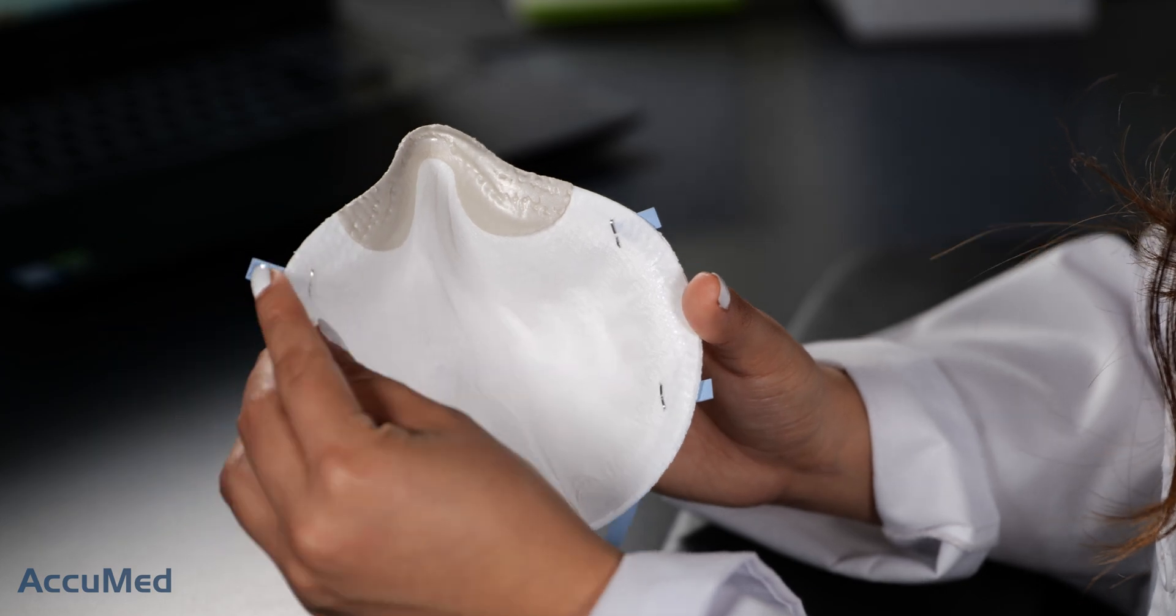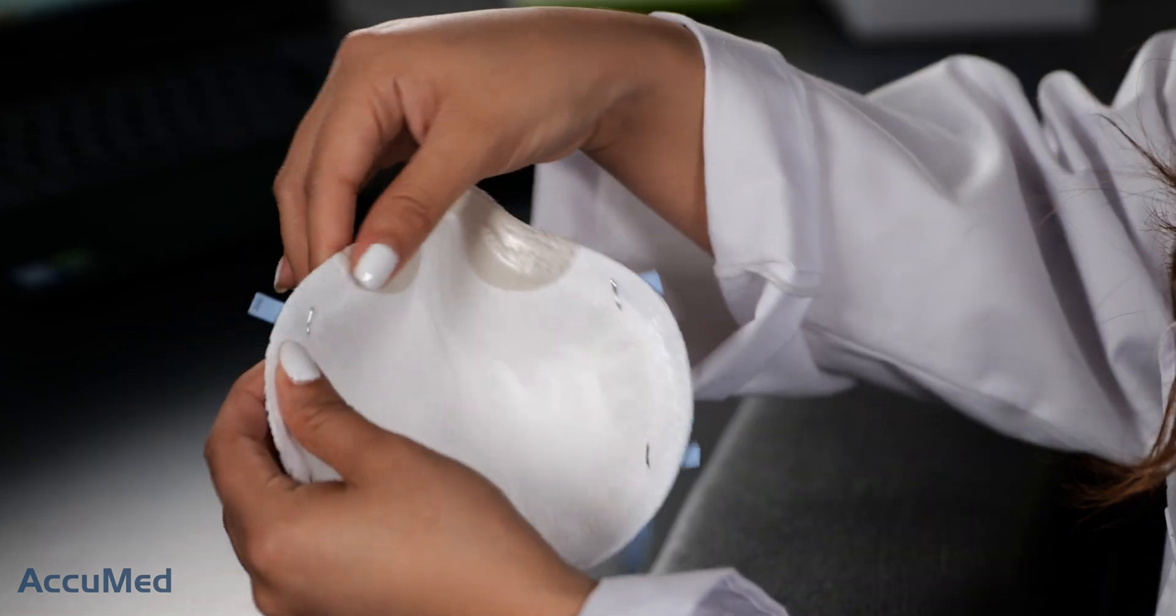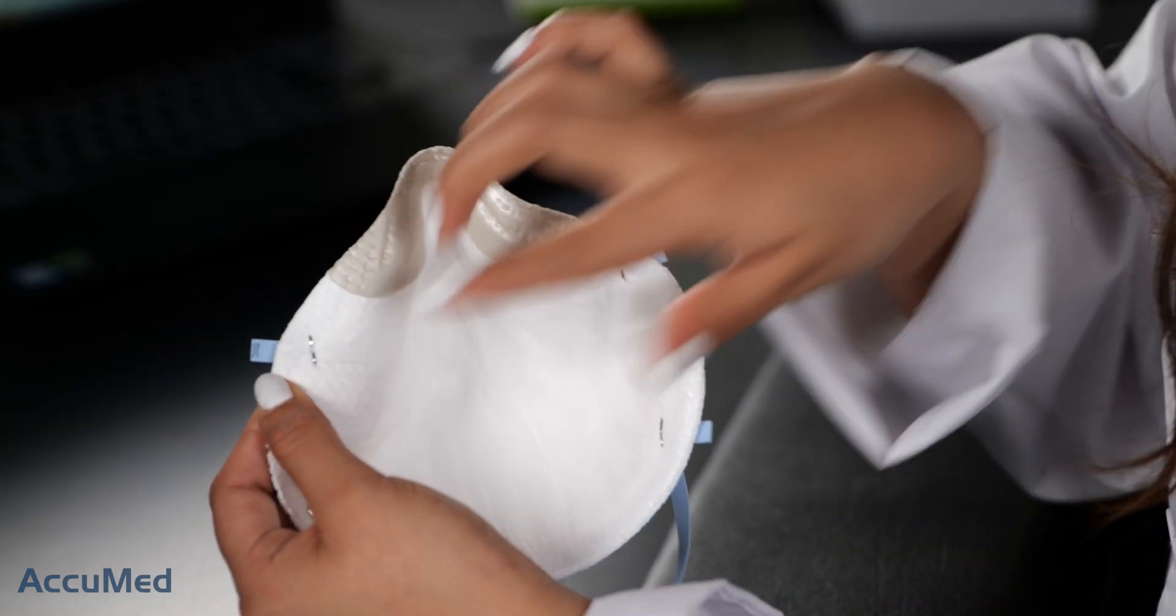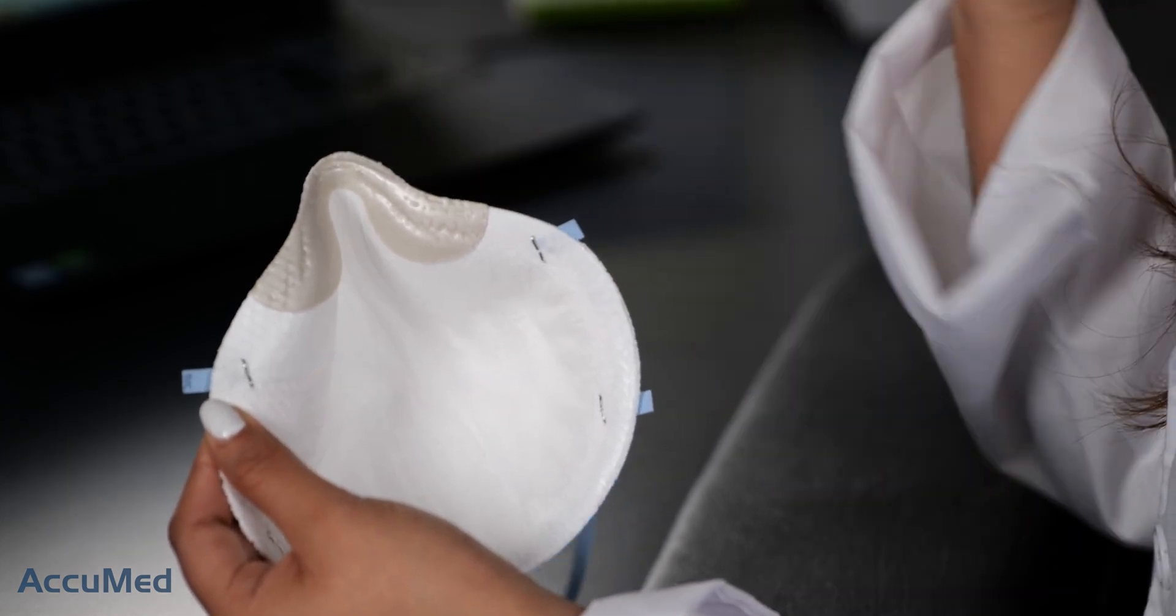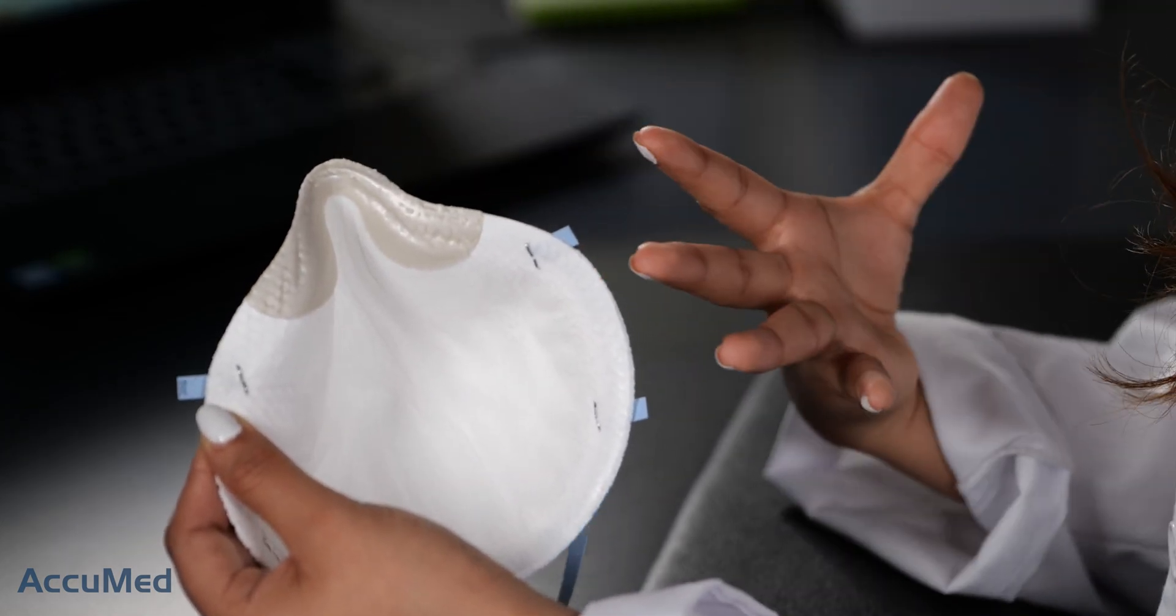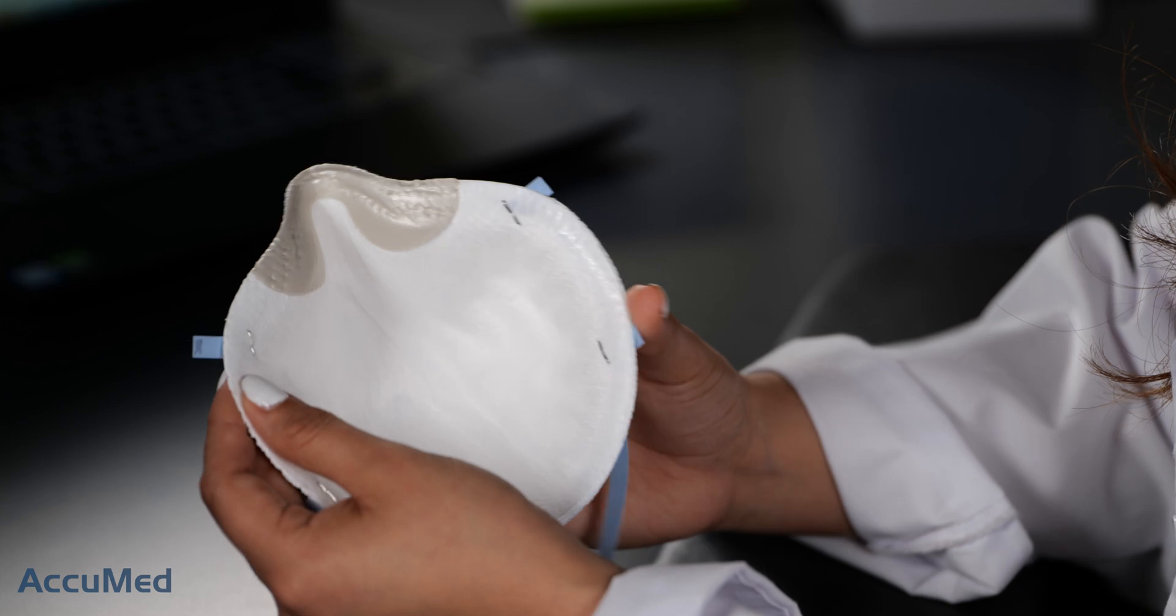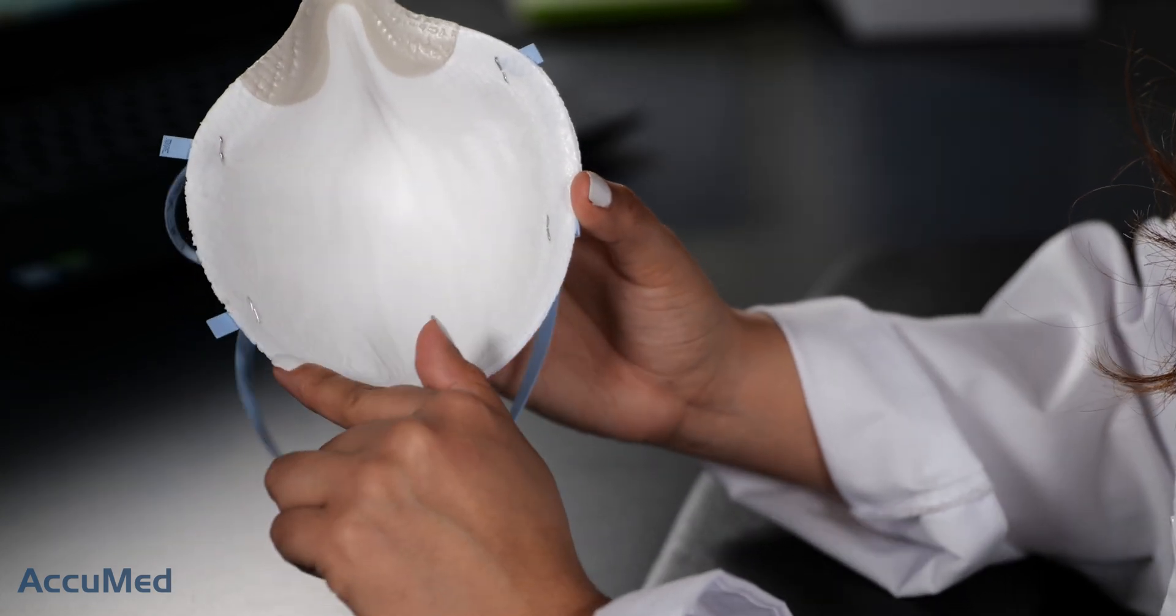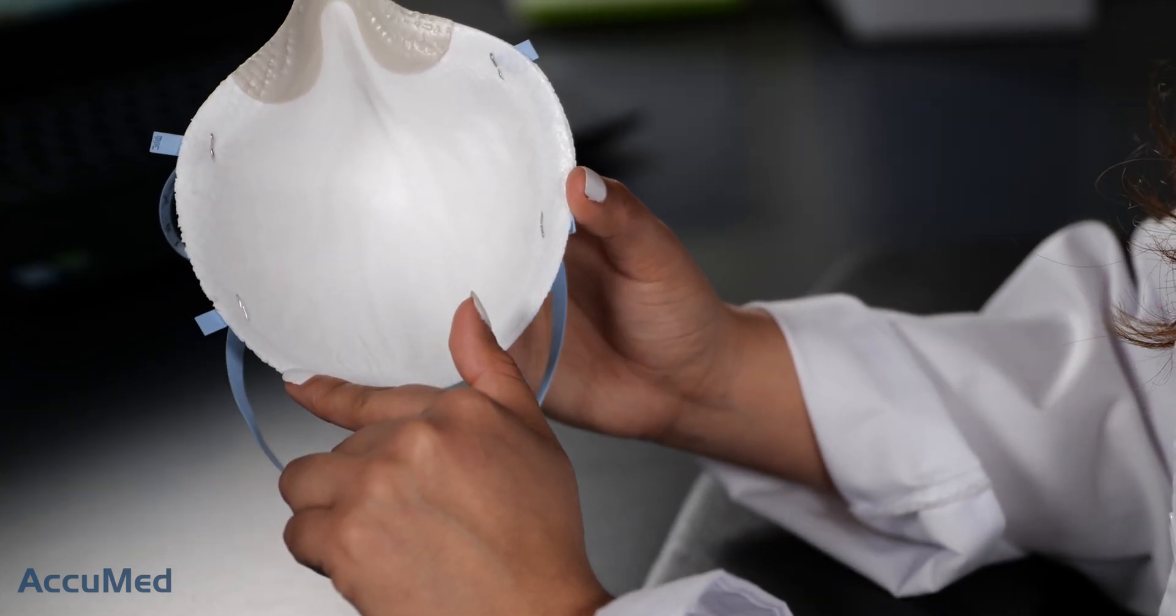Another issue that I did have was because of the nose wire not being there, I did have a little bit of leak on the nose and it was a little hard for me to adjust it to my face shape. One thing I wanted to point out was that the staples on this mask may cause some irritation on some users. In the past, we have distributed masks with staples and although the staples do not affect filtration, we have had some instances where our customers have complained that the staples scratch or irritate their face.